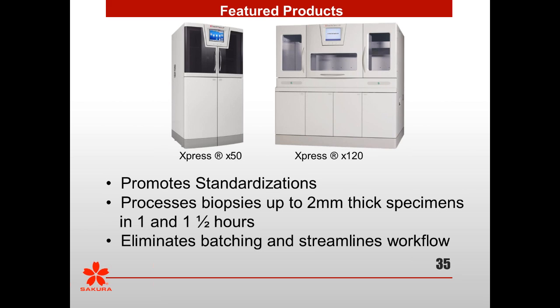Thank you, Bill. The next question states, nice micrographs. Besides IHC, what other molecular techniques are you performing in your lab that require rapid processing? Well, there are other molecular probes. We do ISH and FISH, and then we have regular probes. Typically, those samples are not going to be formalin fixed. They're going to be fresh samples moved right to a molecular fixative.